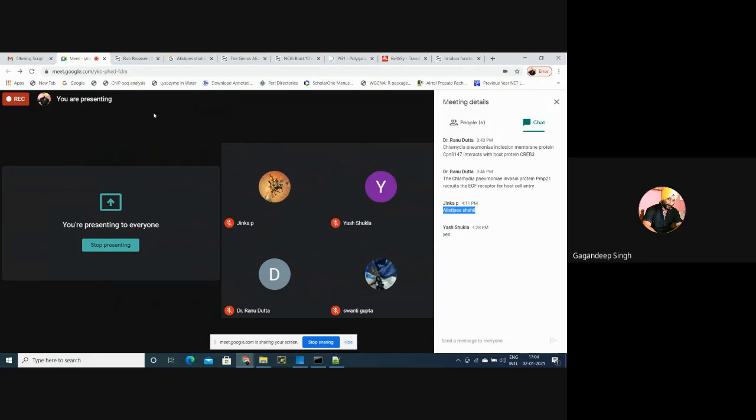What I can do, I'll map my reads with that contig, to see how many reads are mapping to a particular contig. The expression is basically reads while generating data. I'll map those reads with a disease condition and normal condition. Then I can get for contig number 17 in disease condition how many reads are mapping. For example, in disease condition 20 reads were mapped, and in normal condition 40 reads were mapped on the same contig, on the same gene.